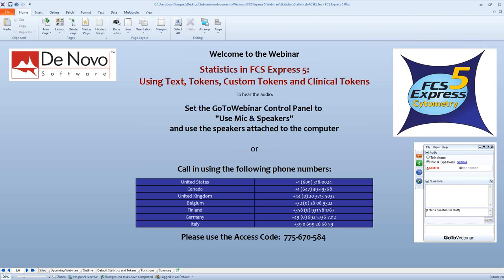At the end of the webinar, we're also going to talk about some of the clinical tokens that are available and some of the things that we can do with them, tokens that are available for the clinical edition of FCS Express 5. Please keep in mind, though, that FCS Express 5 clinical is not yet available. We do intend on releasing FCS Express 5 in a couple months. Okay, so let's just get right into it.